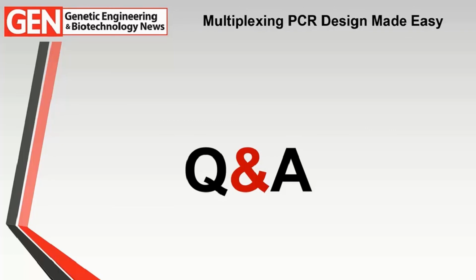Some of the rate limiting steps are more like how long is the target you're having us analyze. For example, a virus target is a lot faster to run than a bacterial target. So it can be a complicated answer to that question. The larger plexes that we do for next-gen sequencing, like a 50-plex, 50 different targets in the human genome, runs in about 20 hours on our system right now. So that's just two benchmark times.